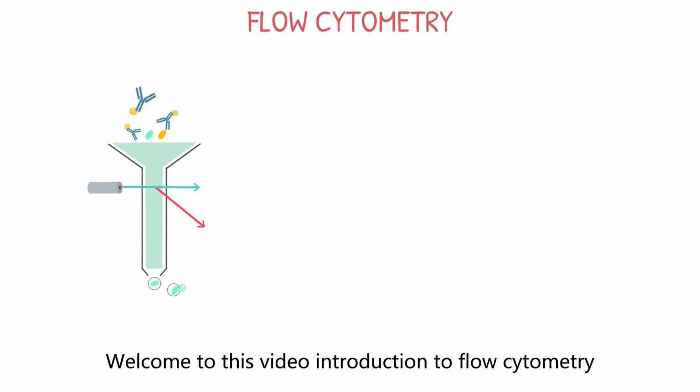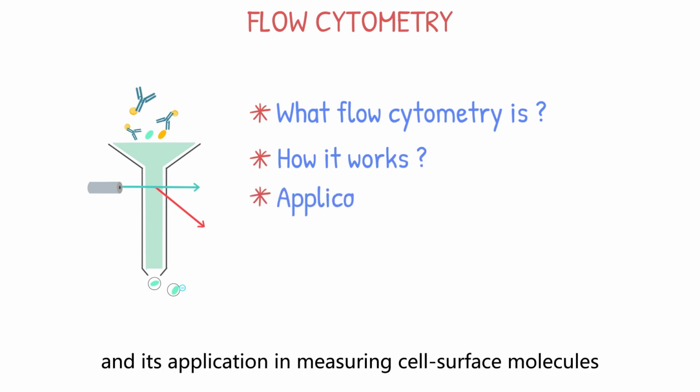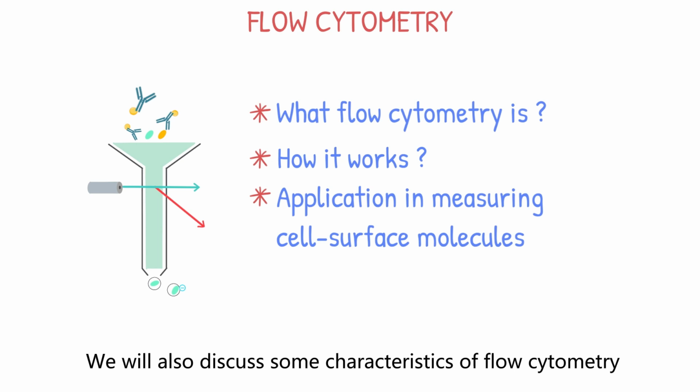Welcome to this video introduction to flow cytometry. In this video, we will explore what flow cytometry is, how it works, and its application in measuring cell surface molecules. We will also discuss some characteristics of flow cytometry.